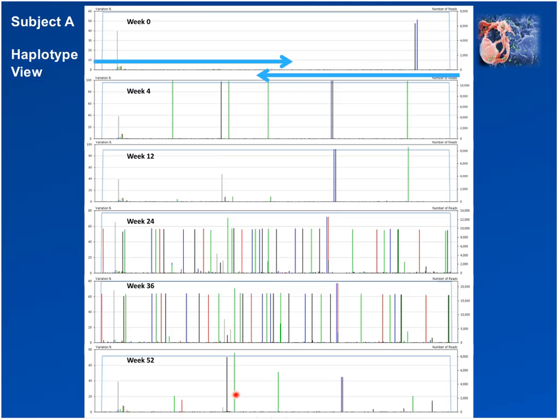So this is an example of what we are also very interested in, which is the tracking of viral haplotypes. In this case, we've tracked the viral haplotype of this individual across the sampling time frame, which is a key aspect of this, that you have specimens representing the same individual over a significant length of time.